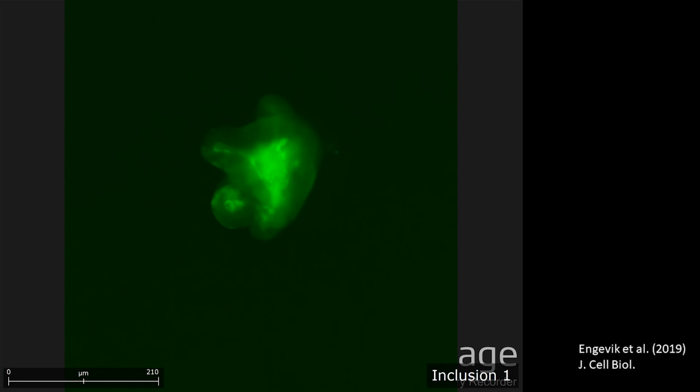This really is a long extension and pinching off that happens. Really, it's over 2.5 hours, and these are big. What you're looking at are inclusions forming that are really 2 to 5 microns in diameter. There's no trouble seeing that. So this has allowed us to do some more mechanistic studies.